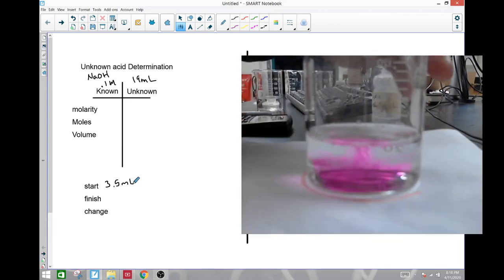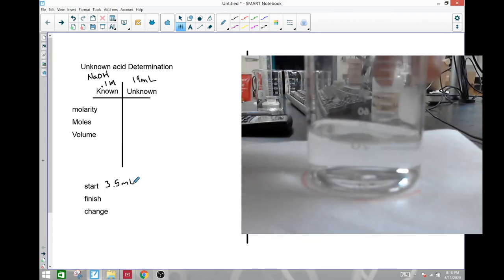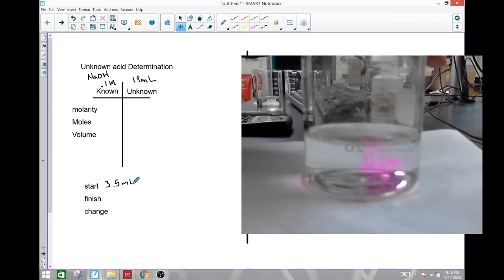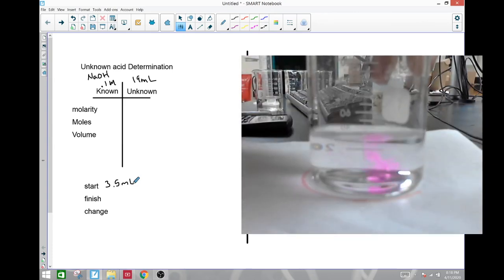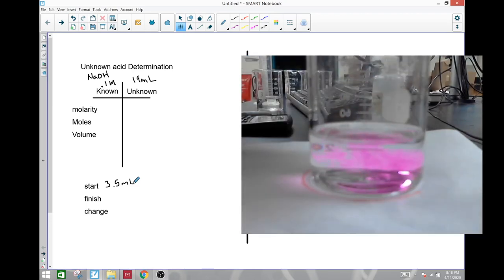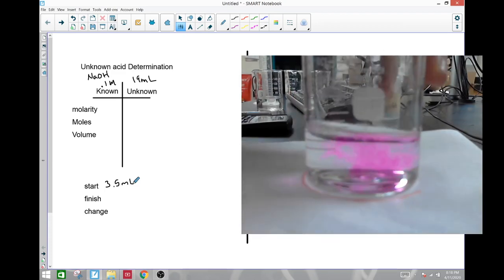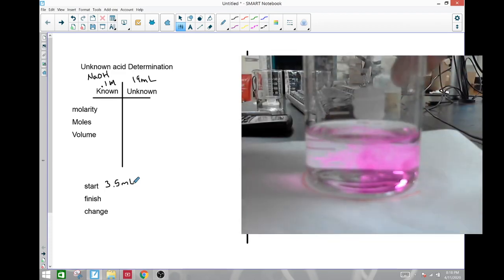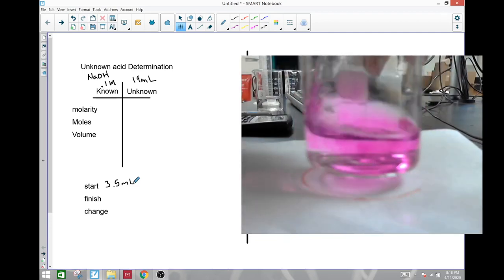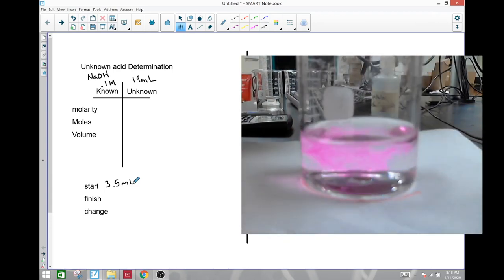Alright, so getting a little bit more. I'm going to turn it off and do a little stir here. Make sure we're doing alright. And I might slow down the amount that I'm adding right now to half that speed maybe. I'm getting closer. And the pink sticks around a little longer until I stir it, and it goes away. And I just get in there. Okay, and the color sticks around a little bit. I'm close.